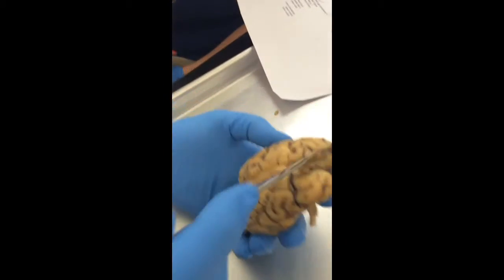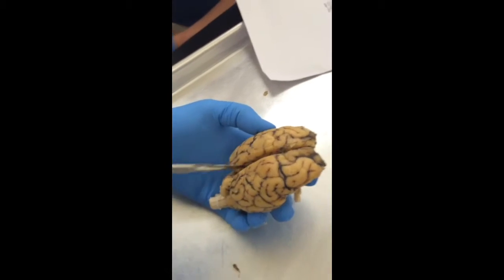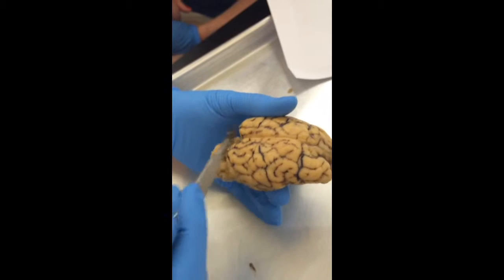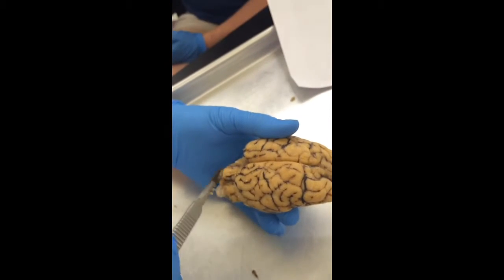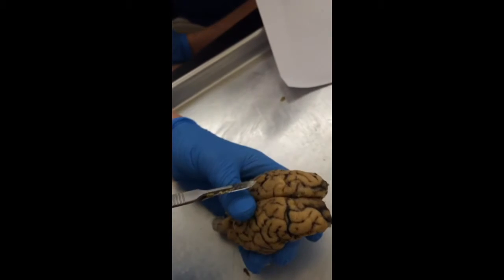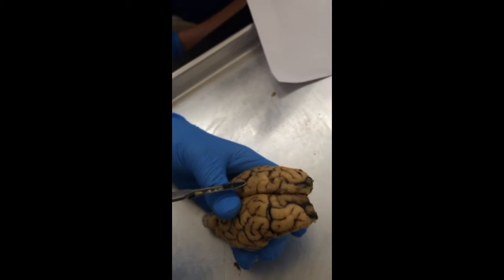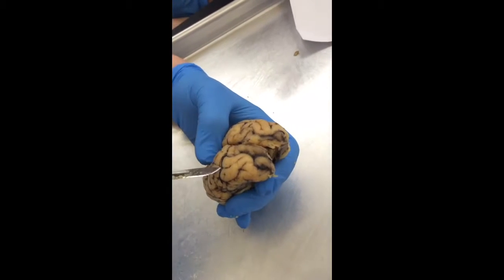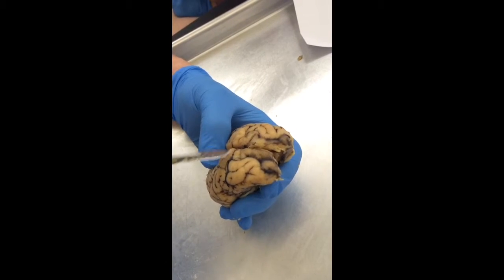We have the cerebral hemispheres. This is the longitudinal fissure. This is the transverse fissure, the space between the cerebrum and the cerebellum. Every little bump is a gyrus. Every little black line is a sulcus. And then your central sulcus is right there. Remember, your frontal is from right there and there.